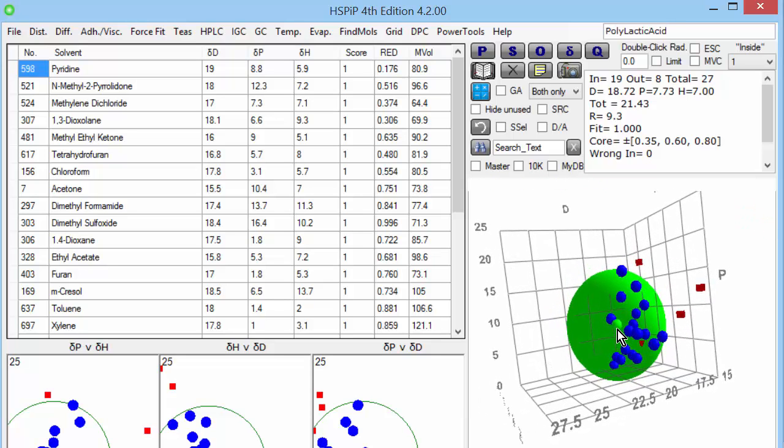And the centre of this sphere is the HSP of the polymer. So in this case, polylactic acid's HSP is 18.7, 7.7, 7.0. And that's it.